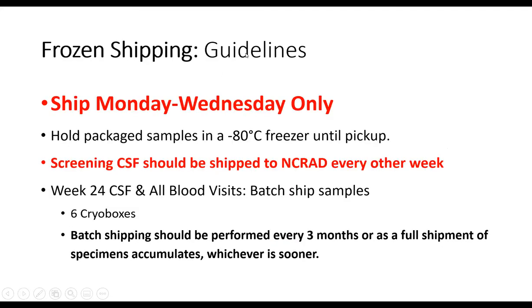So all of these samples are going to be frozen and shipped to NCRAD frozen. So please only ship Monday through Wednesdays. We want to do that to ensure that there are no courier delays that will cause shipments to be held at a hub over the weekend and dry ice to be melted and samples to be thawed. So please make sure you ship Monday through Wednesday.